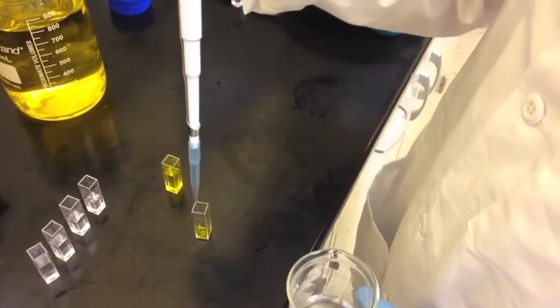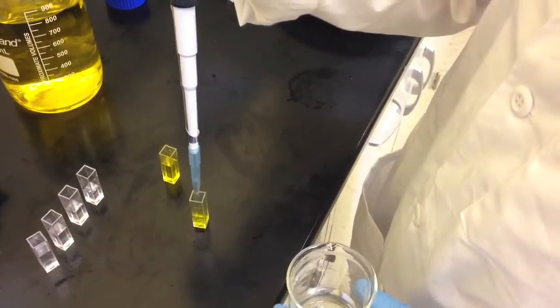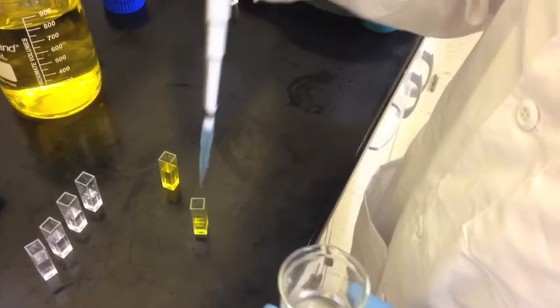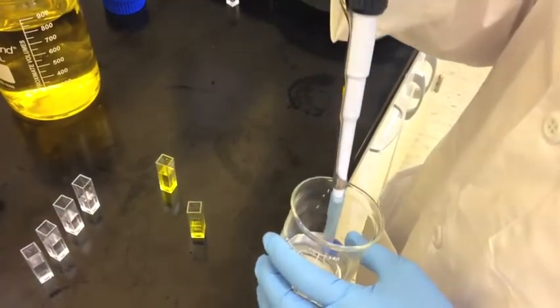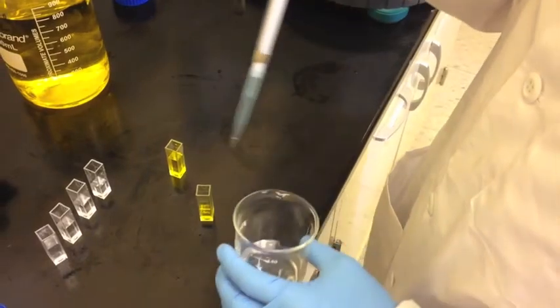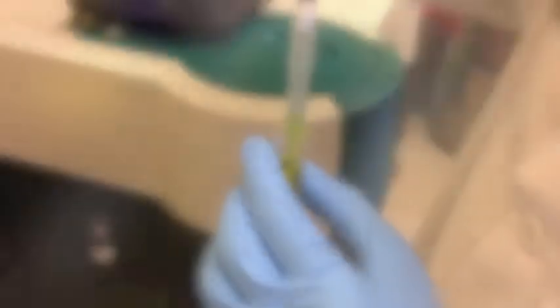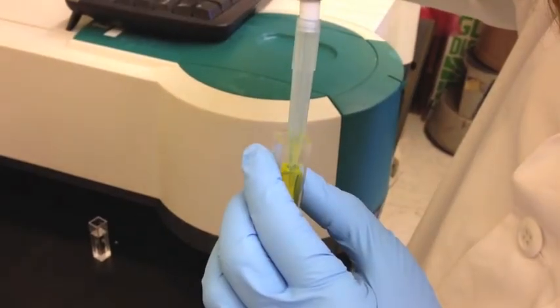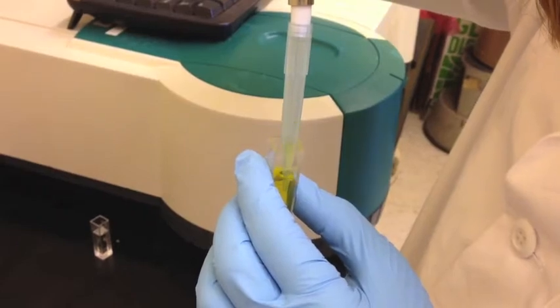A calibration curve for tartrazine was then made for the spectrophotometer at 427 nanometers. A calibration curve was made by diluting tartrazine solution and measuring the absorbance, until an absorbance of 0.25 to 0.1 was found. When diluting the solution with DI water, it is important to make sure it is well mixed.